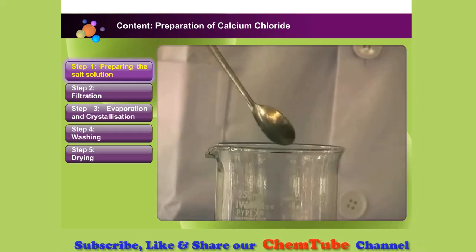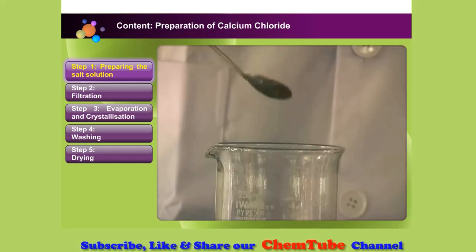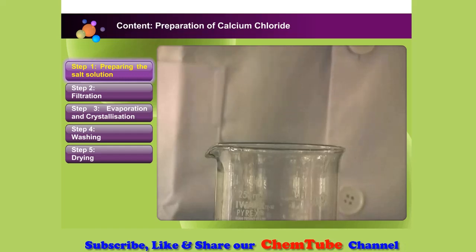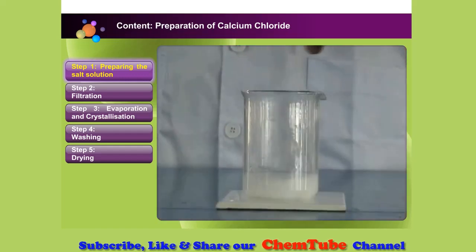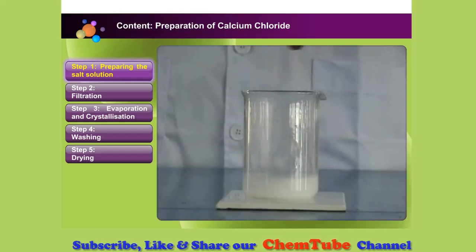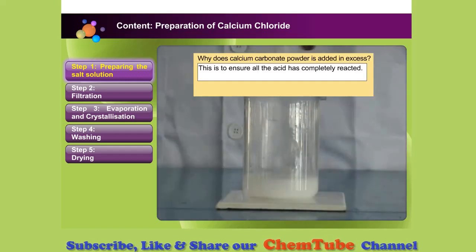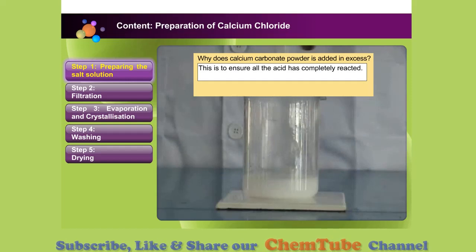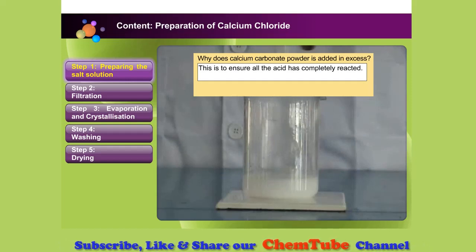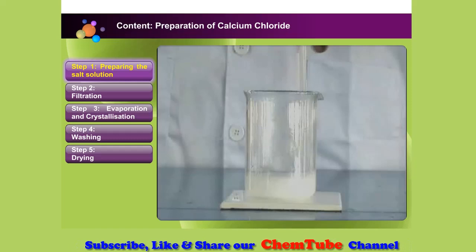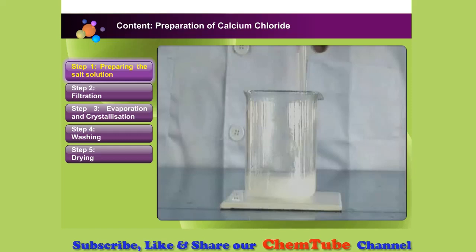Now, add in excess calcium carbonate powder and stir well. This is to ensure all the acid has completely reacted. We have now obtained the calcium chloride salt solution.